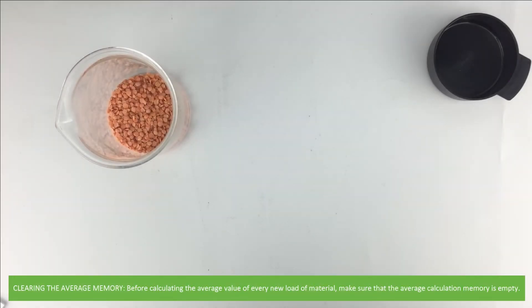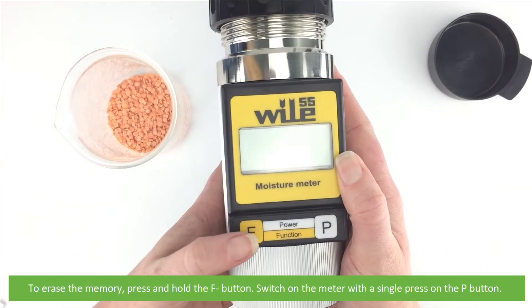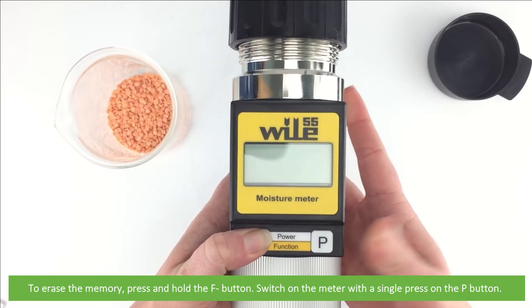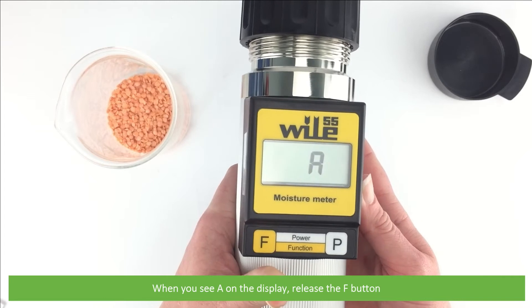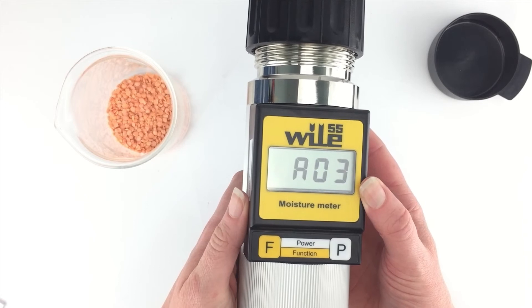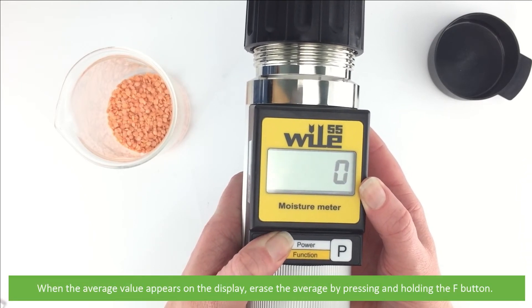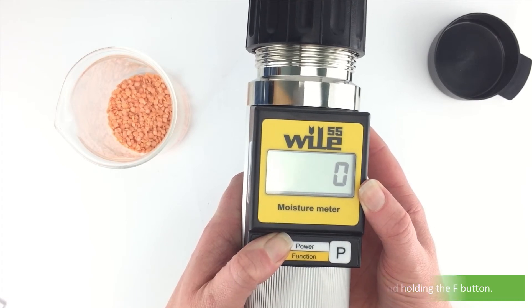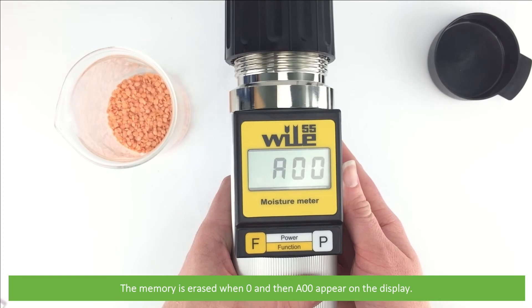Before calculating the average value of every new load or material, make sure that the average calculation memory is empty. To erase the memory, press and hold the F button, then switch on the meter with a single press of the P button. When you see 'A' on the display, release the F button. When the average value appears, erase the average by pressing and holding the F button. The memory is erased when '0' and 'A00' appear on the display.